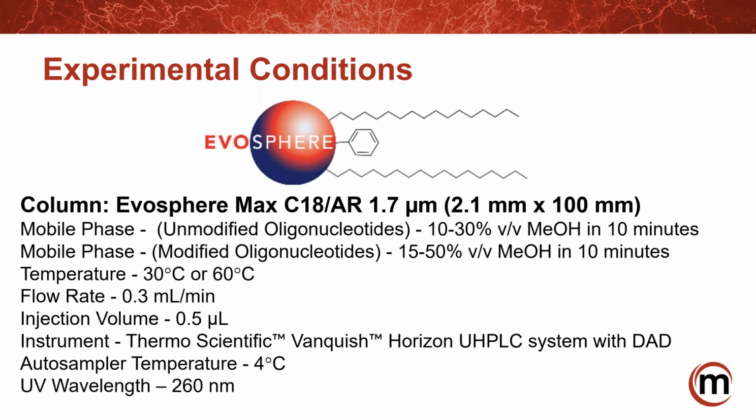Then, just curious, did you evaluate other types of phenyl-based bonded phases? In the original scope of work, the Polish university had looked at amide chemistries. They had looked at reverse phase C18. They had looked at an extended alkyl cyano phase chemistry, and a similar chemistry to the C18AR, a hydrophobic phenyl modified chemistry.